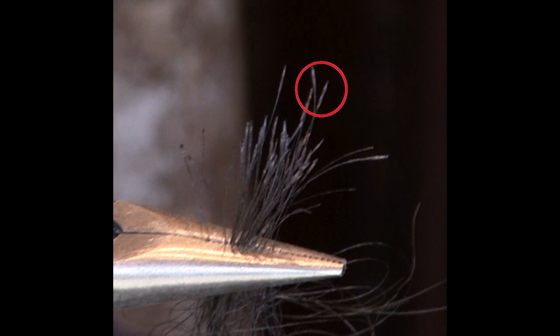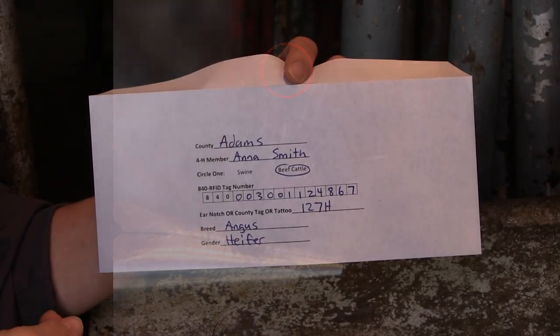Repeat the pulling process if necessary until you have enough hair with roots. Visually inspect the hairs to ensure the roots are attached. These appear as clear or white tips on the ends of the hair. If the roots are not present, discard the sample and start over.